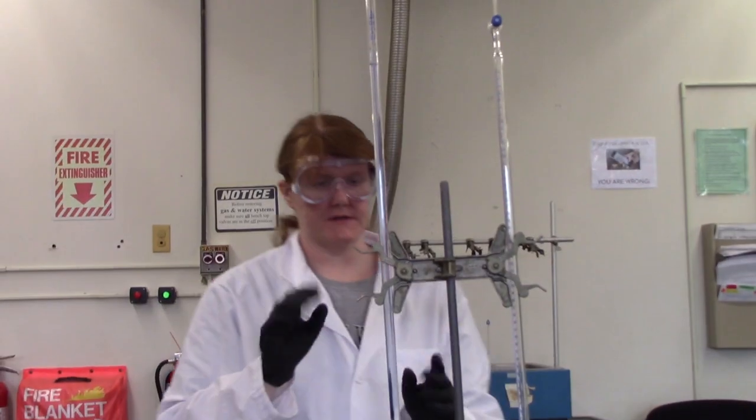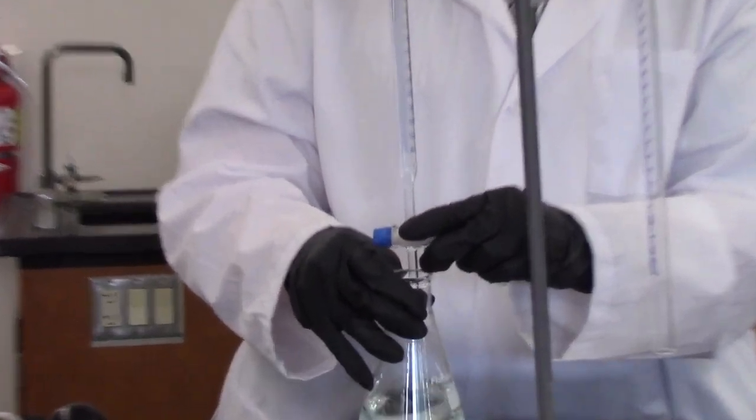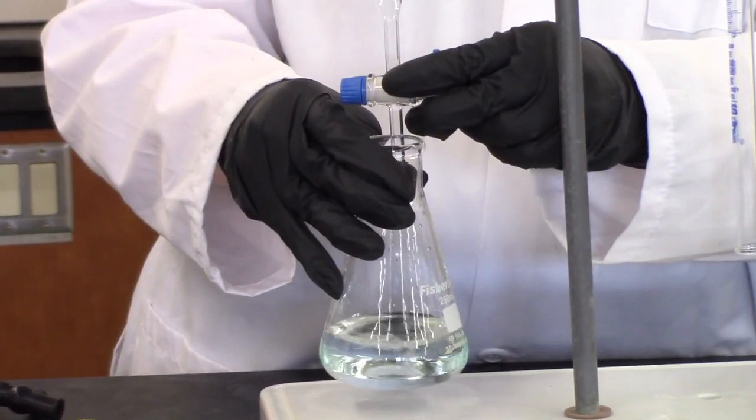So, back to titrating. I actually do it backwards. It's kind of strange, but I do. And so we just keep adding and adding and adding. We're seeing a little bit of blue tint. That's from my dye that I had in there earlier.